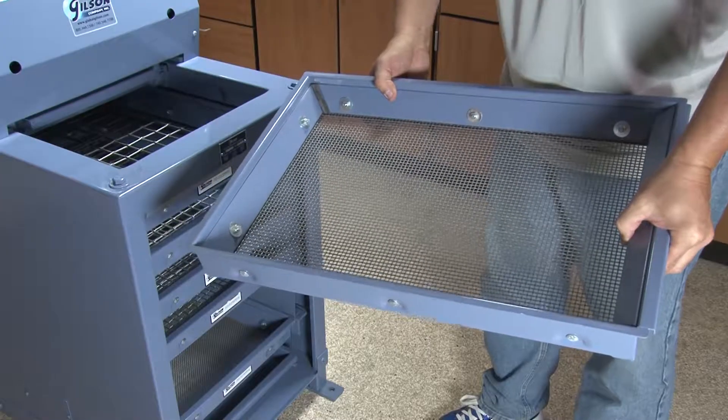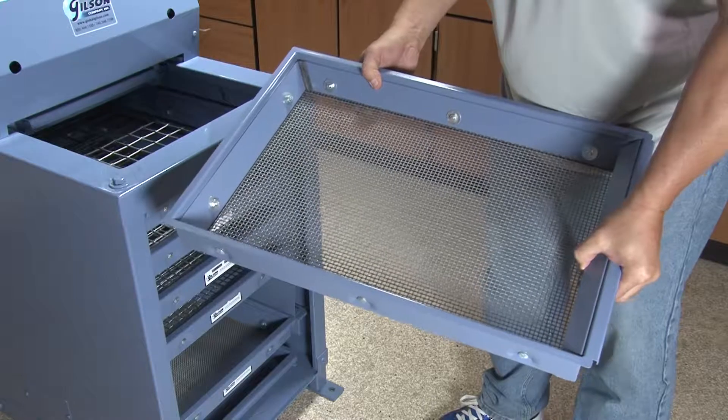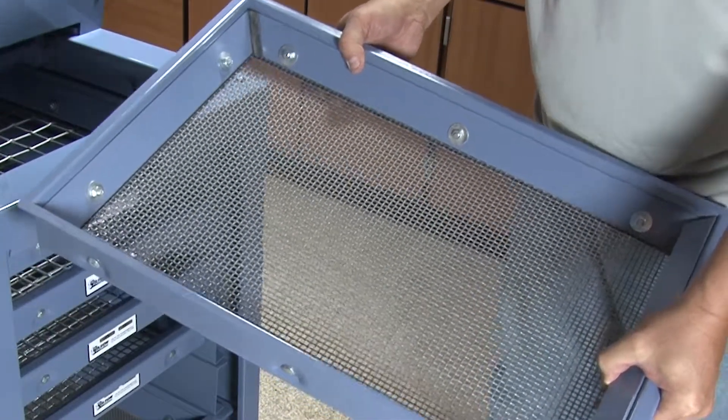Gilson offers a complete selection of screen trays for the Testing Screen, TestMaster, PortaScreen, and other screening units.